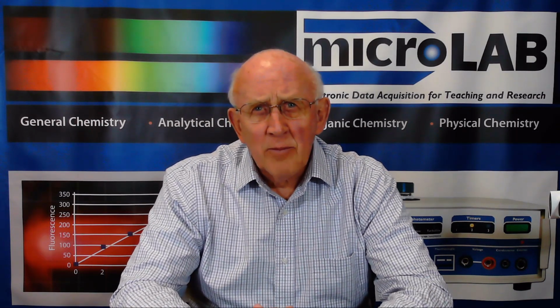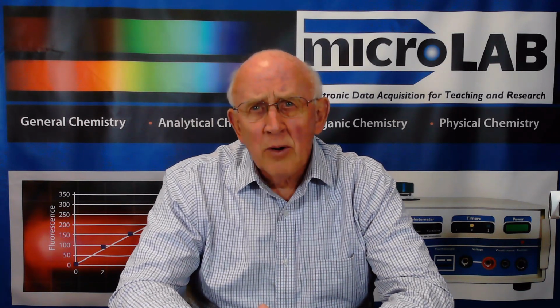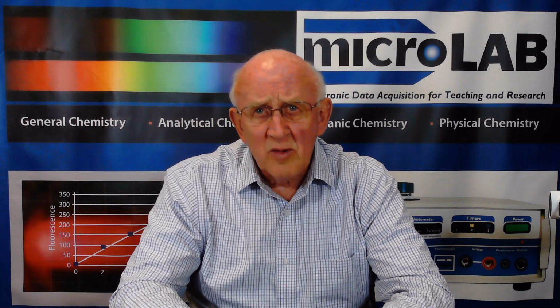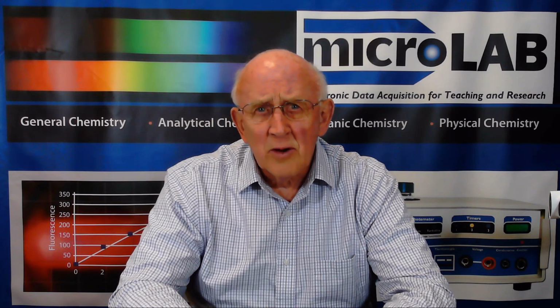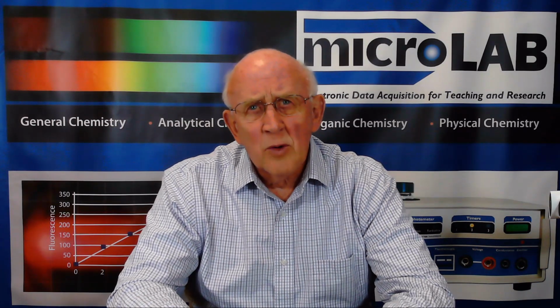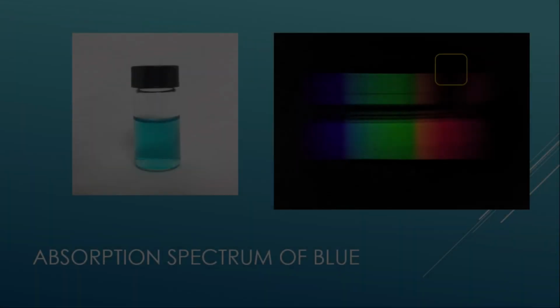I'm John Amond, Professor of Chemistry Emeritus at Montana State University. Part one of this series was about color and how color is what's left over when something is taken out of a continuous white spectrum. Part two, today, we'll use this selective absorption of light to measure the concentration of colored solutions. It's called spectrophotometry and is the most used analytical technique in medicine and chemistry.